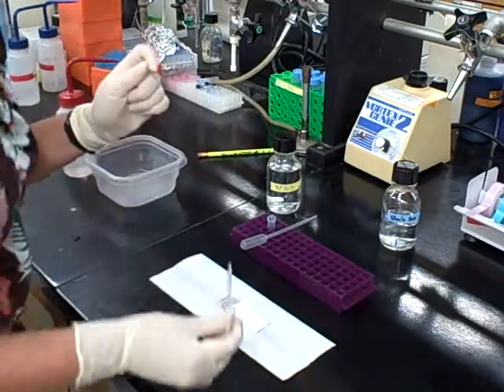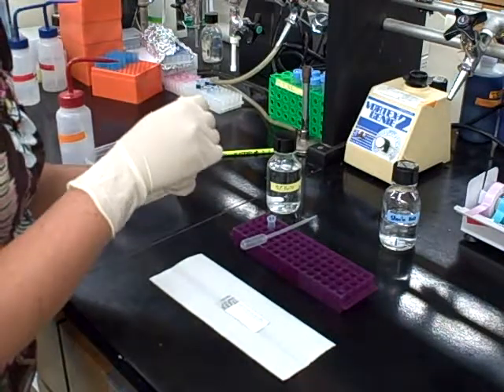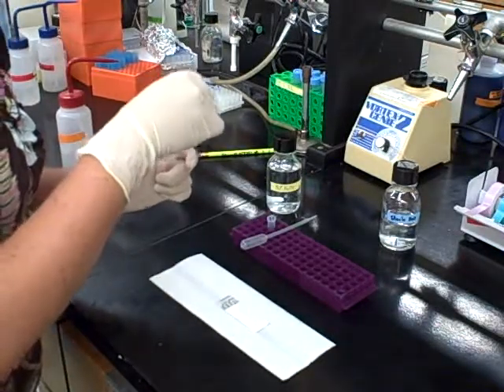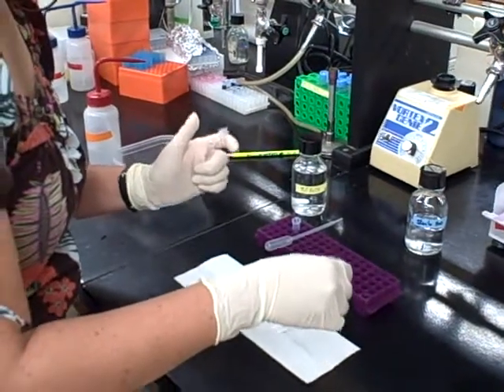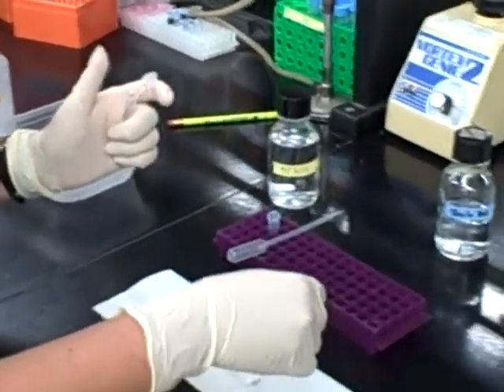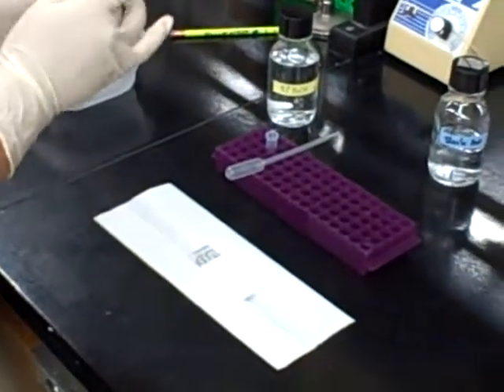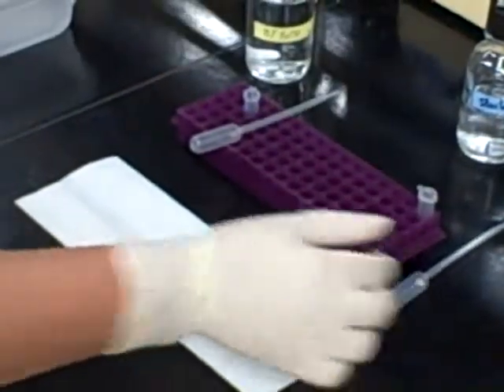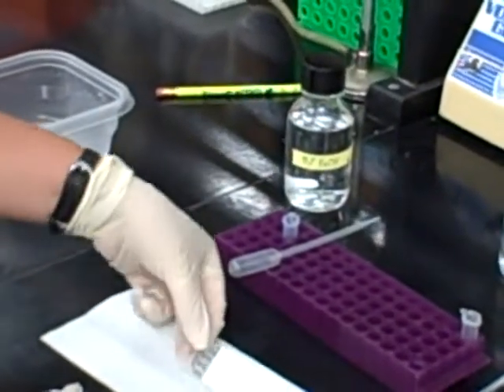Now the cDNA mix is just water, so it's perfectly safe. However, the students are told that it is a cDNA mix. Completely cover the slide.